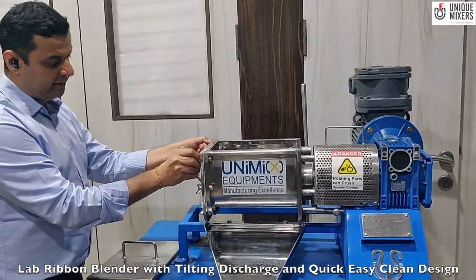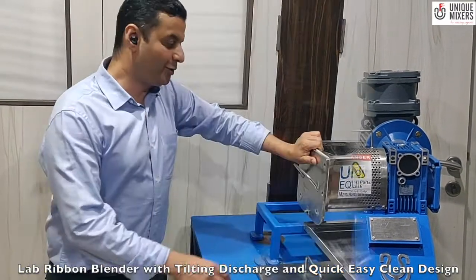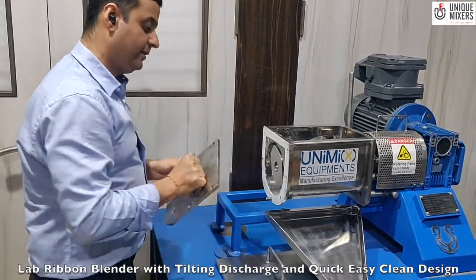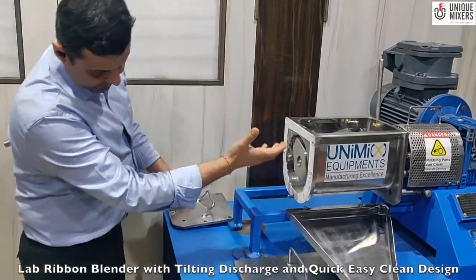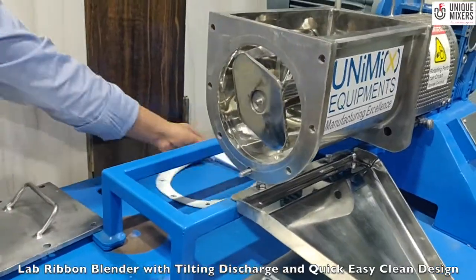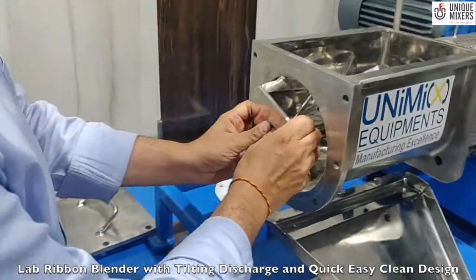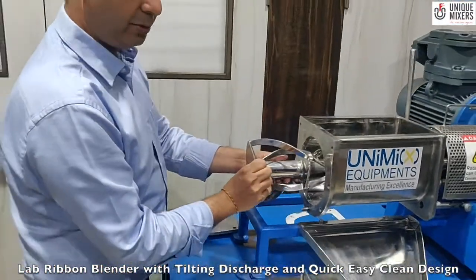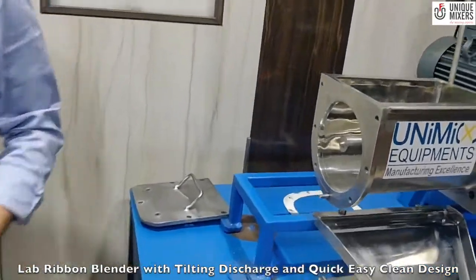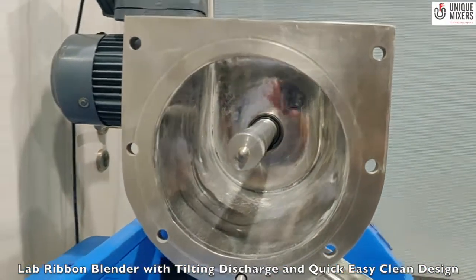The non-drive end here is a removable design. I have quick opening bolts which I can just open. As we talked about the quick clean design, we are able to open the end plate here and the agitator is open from this end. You can see the agitator is in open condition and if I need to pull out the impeller, the container inside is easily cleanable.